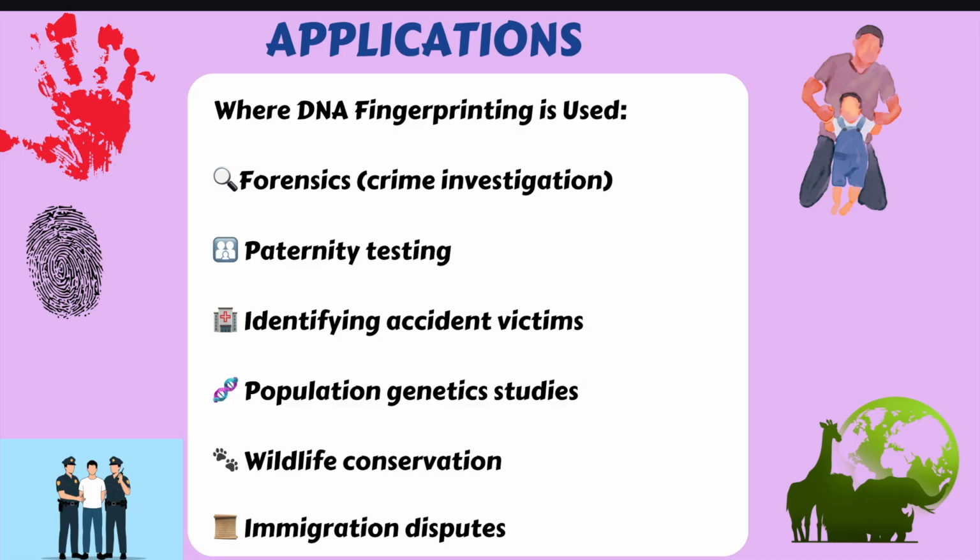They extract the DNA from bone and teeth and then do the VNTR analysis and compare it to the living relatives of the dead people. And after that, because a child's profile is a 50-50 combination of their parents' bands, forensic experts can confirm an identity with near absolute certainty by matching these unique genetic barcodes.